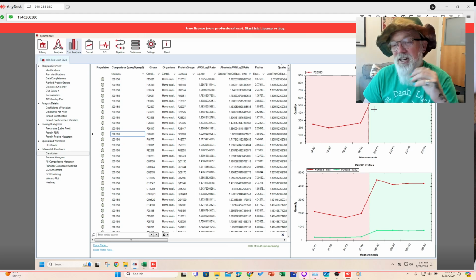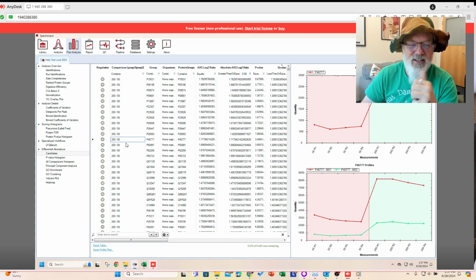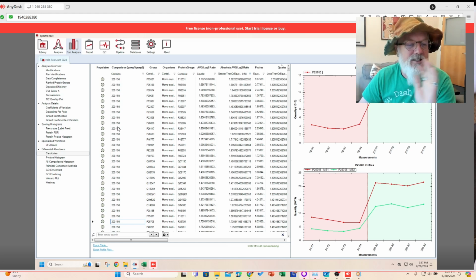Mass spectrometry works. Proteomics works. We loaded in 4x the material. We see almost everything changing, so good. Everything's working. All right, that's exactly what we want. All right, so let's look at the LFQ bench.